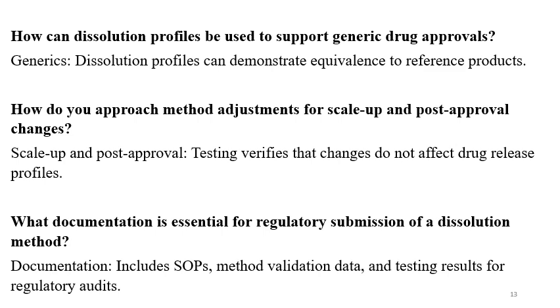Testing verifies that changes do not affect the drug release profile, and thereby we can take the approach for method adjustments. What documentation is essential for regulatory submission of a dissolution method? It includes SOPs, method validation data, and testing results for the regulatory audits.